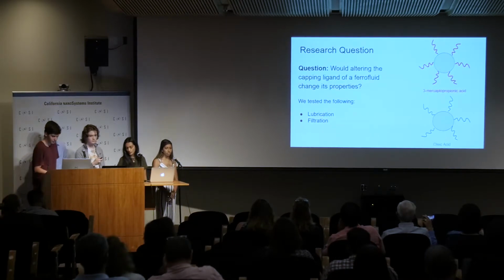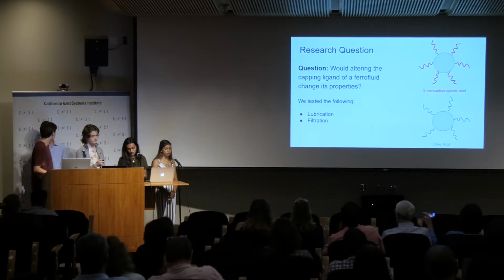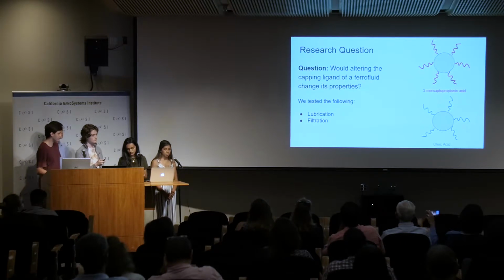Our research question is, would altering the capping ligand of a ferrofluid change its properties? We tested this by testing ferrofluid as a lubricant and testing ferrofluid as a filter.